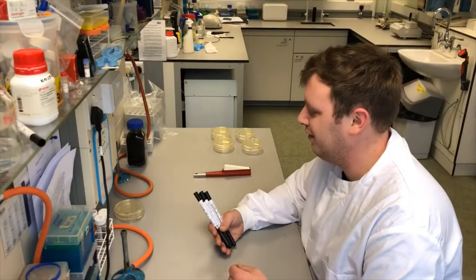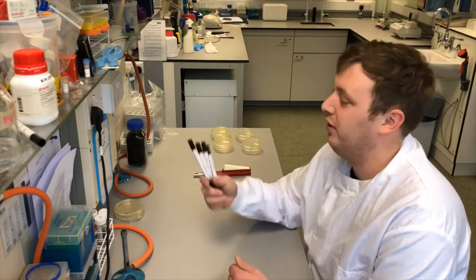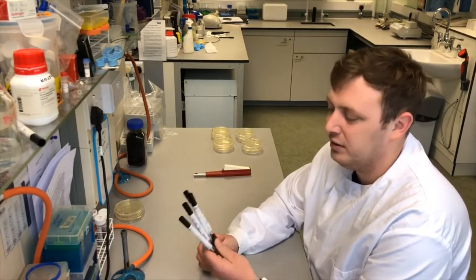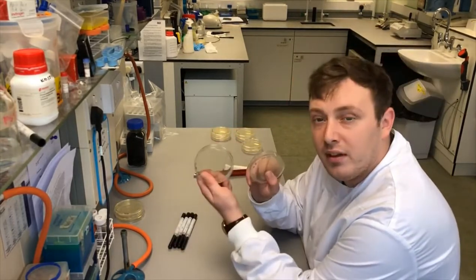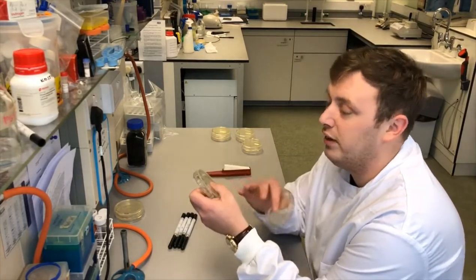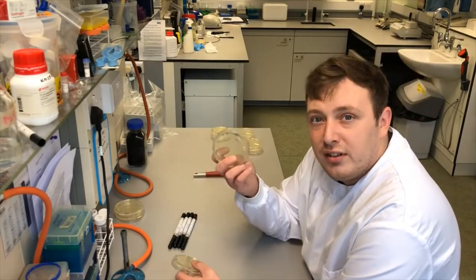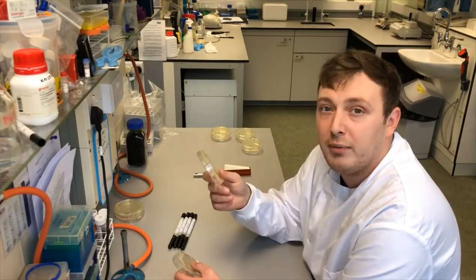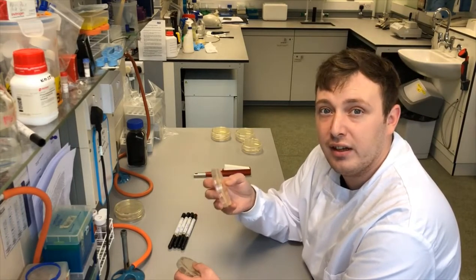So today we're going to plate our samples out. We've got our swabs taken from the trumpet — from the mouthpiece, the lead pipe, the main slide, and the bell — and we're going to plate them onto agar plates. Left on the bench overnight at 20 degrees, we'll see all the environmental bacteria. When we put them in the 37-degree incubator, they should show us pathogenic bacteria, because they'll have been incubated at body temperature — any bacteria that can live in the human body.